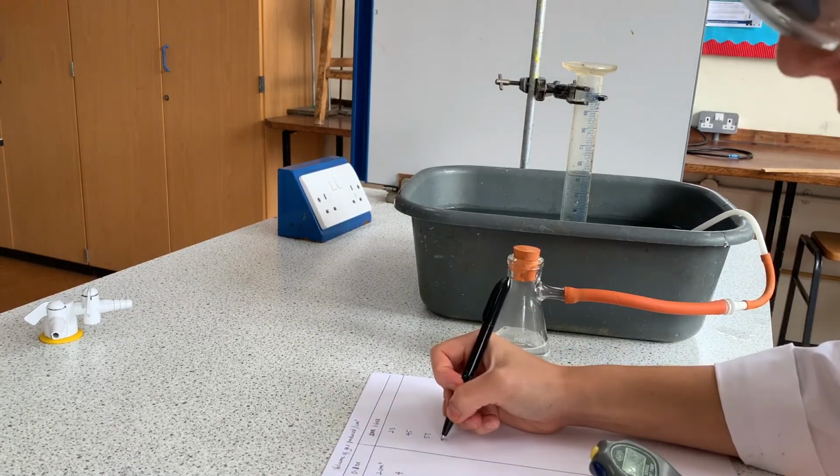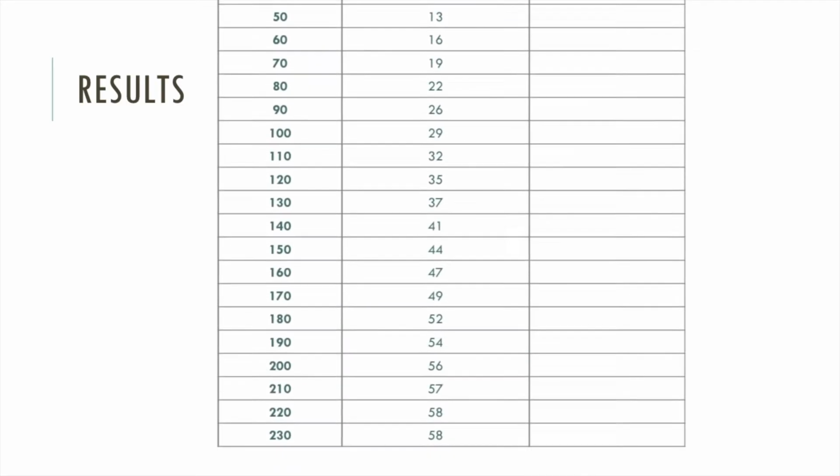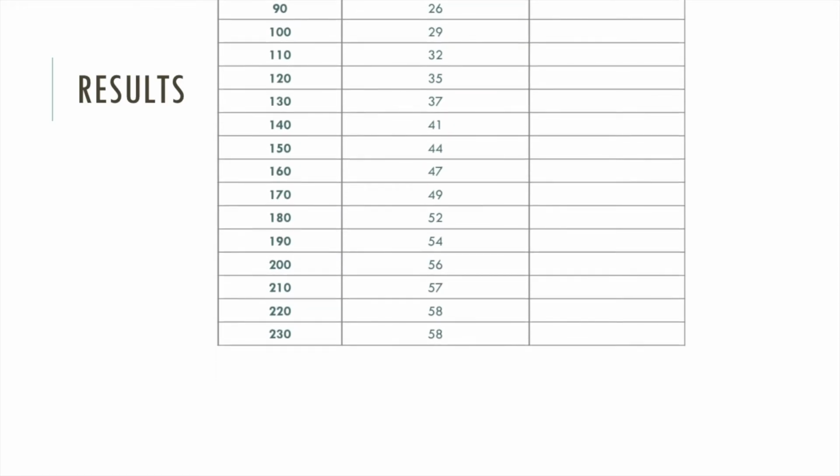Let's have a look at these results more closely. So here is my results table in full. You can see it took much longer for the reaction to finish with the less concentrated acid.